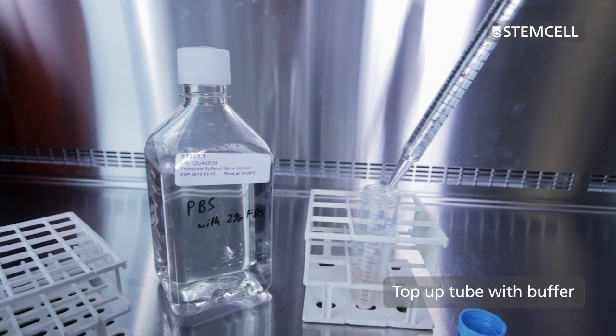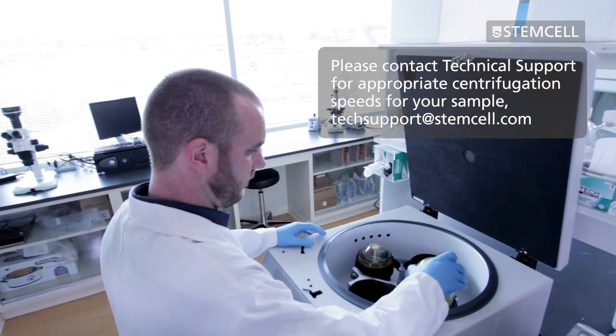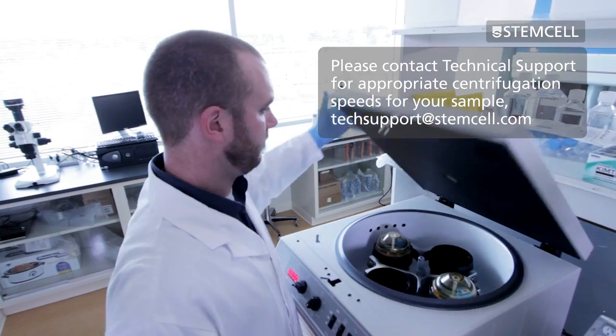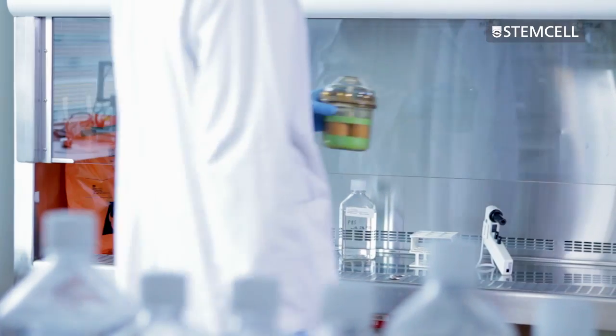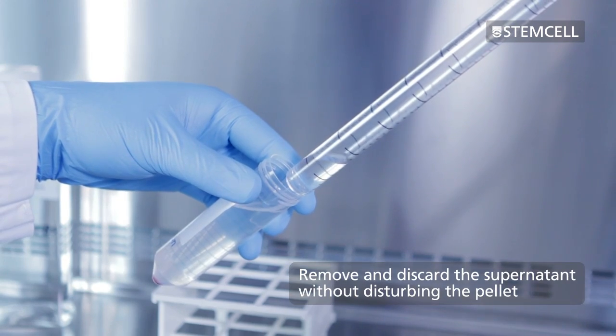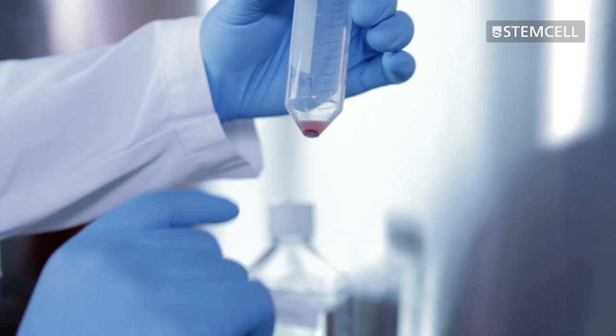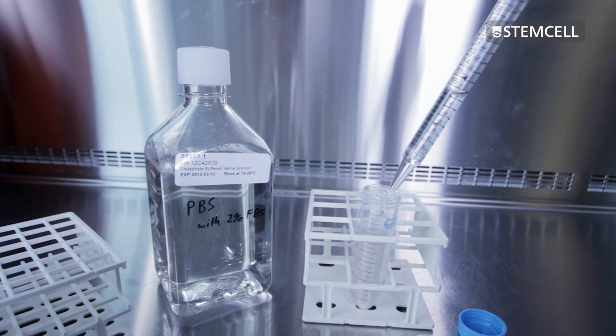Top up the tube containing the cell suspension with PBS and collect the cells by centrifugation. Carefully remove and discard the supernatant without disturbing the pellet. Gently tap the tube to resuspend the pellet. You may wish to do an optional wash at this stage.